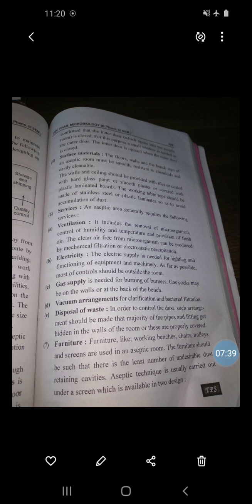The working tabletop should be made of stainless steel or plastic laminate so as to avoid accumulation of dust.